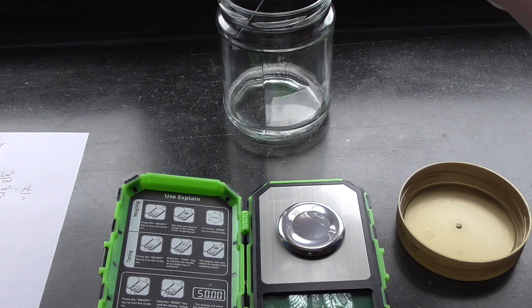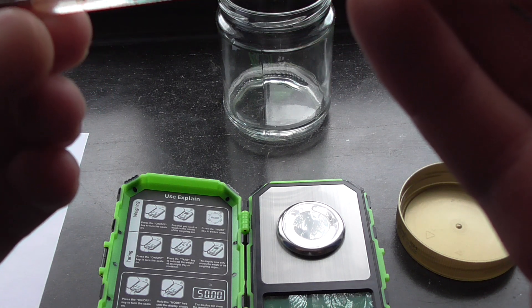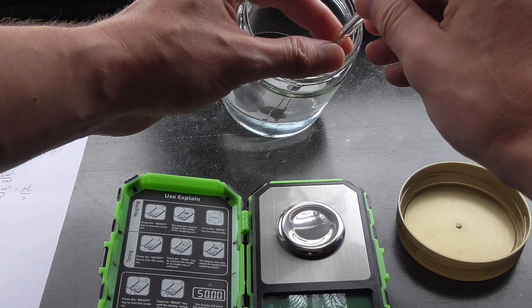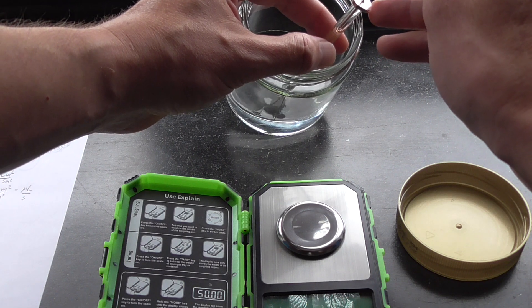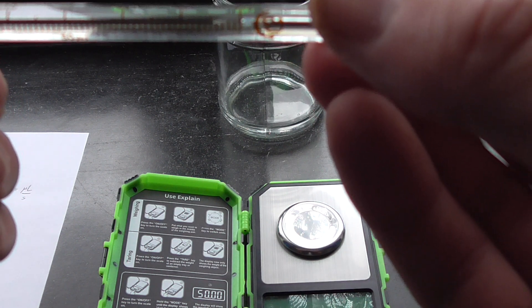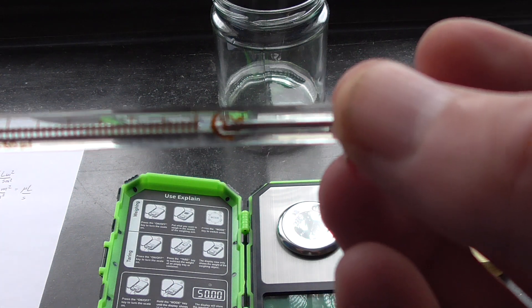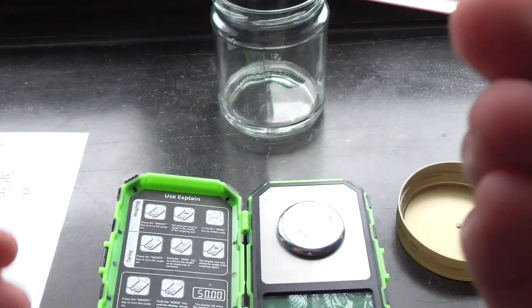Still a little bubble — I think I can push it out. Yes, it's a bubble; let's try again, it's not so easy as I thought. A little bit more slowly. It looks like just a little bubble, but I can compensate for that by having sucked a little bit more inside, so it should be 50 microliters. Okay, now let's turn on the scale.